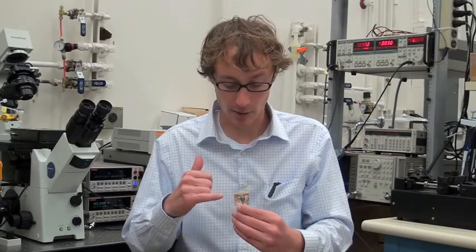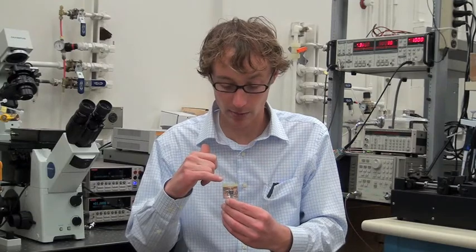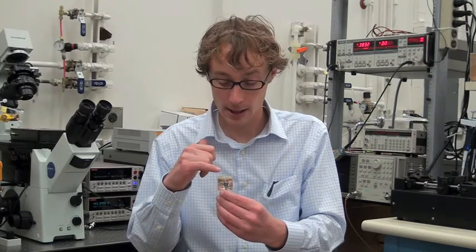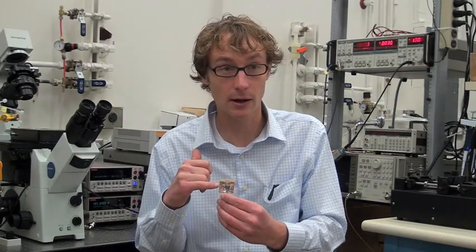The heart of the device has two components. The first is the microfluidic chip, which is this clear part - a piece of glass with a polymer molded on top of it. That's attached to this electronic readout chip that has some very simple electronics. The device is small and, in principle, could be fit into a portable readout device.